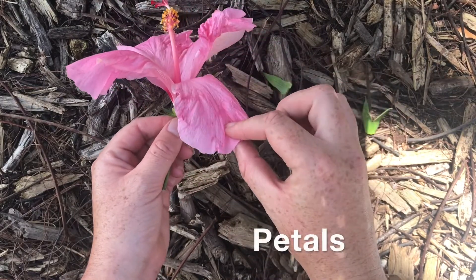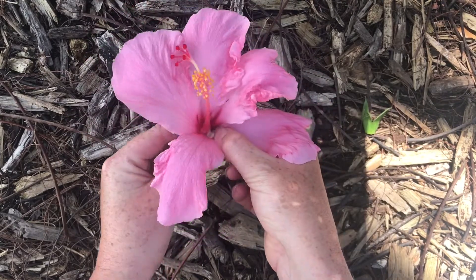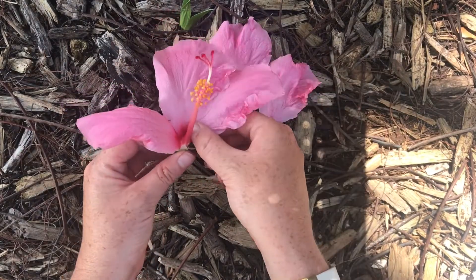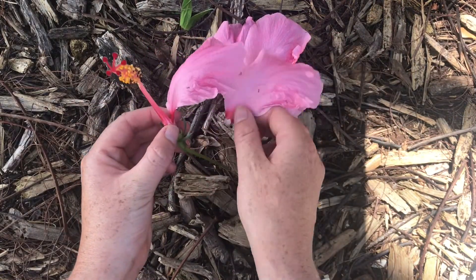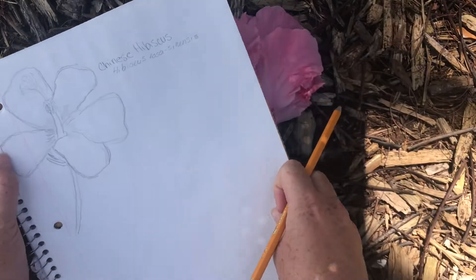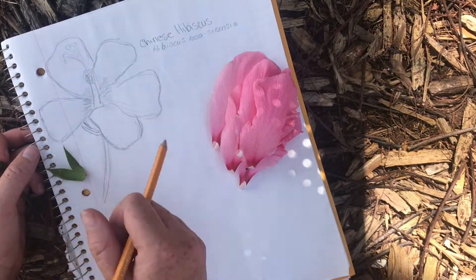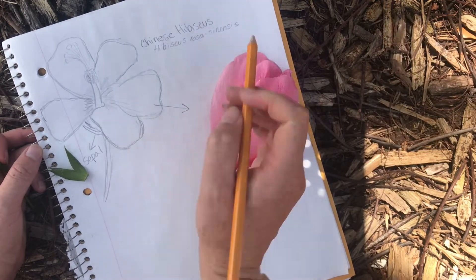The next step in our dissection is to remove the petals. To remove each petal, simply pull on it from the center and remove it from the stem. Set each petal aside. The petals of a flower are really important — they're brightly colored or oddly shaped, and this is to attract pollinators. Pollinators are things like bees, butterflies, birds, or bats that come to the flower and help transport pollen. Before we go too much further, take a minute to label the parts of your flower we've already taken off. Remember the sepals are the small green leaves, and we took off all of the petals.